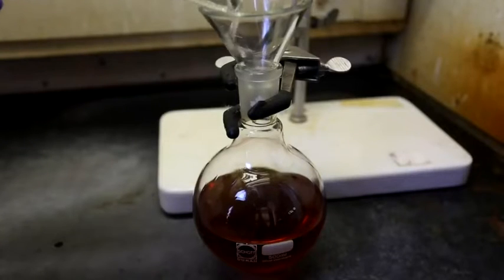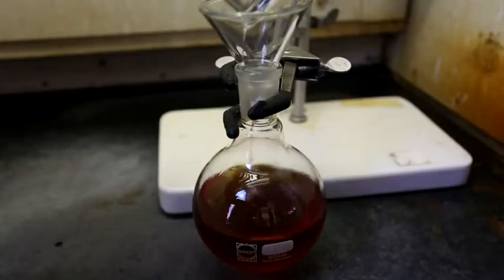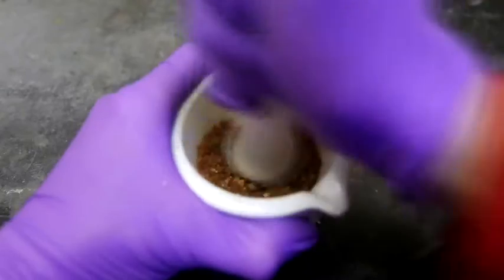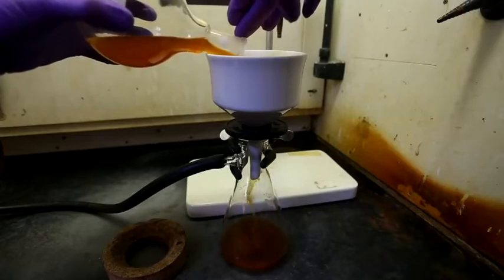Next is to begin by building a rig using stands and clamps to support the extraction apparatus. The solvent used, which is ethanol, 250 milliliters of it, is added to a round bottom flask, which is attached to a Soxhlet extractor. The crushed sample is loaded into the thimble, which is placed inside the Soxhlet extractor.